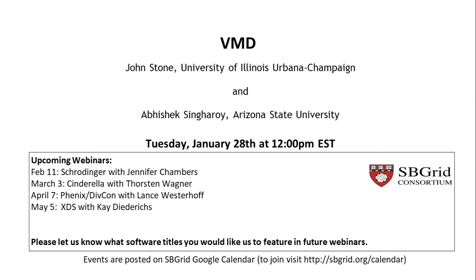And so one of the things they directed us to think about was, they posed the challenge. So now imagine you can get a tomogram that's near atomic resolution. Maybe it's 4 angstroms or something like this. Maybe it's 3.5. That's what they were talking about. If you have something the scale of an entire cell, now you want to automatically label all of the contents of that cell by recognizing its constituent particles and things like this. An example would be, if you have ribosomes all throughout that cell, you want to label all those ribosomes. You want to identify what these different components are, all the microtubules.